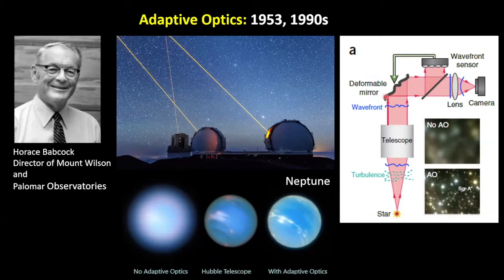It's a little bit similar to the noise-canceling headsets that are so popular right now. You can have another out-of-phase sound cancel the noise. This is a similar technology, but it corrects for light distortion.